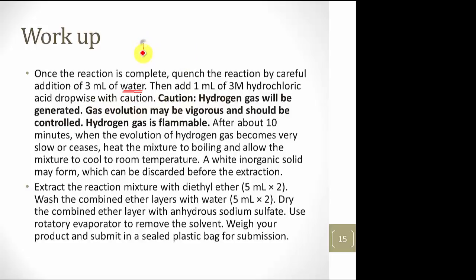H2 could be produced because you had used excess hydride, borohydride. In the presence of a protic solvent like water, a very good protic solvent, you would have the generation of hydrogen gas. Very flammable indeed, but it's a very clean and green fuel.